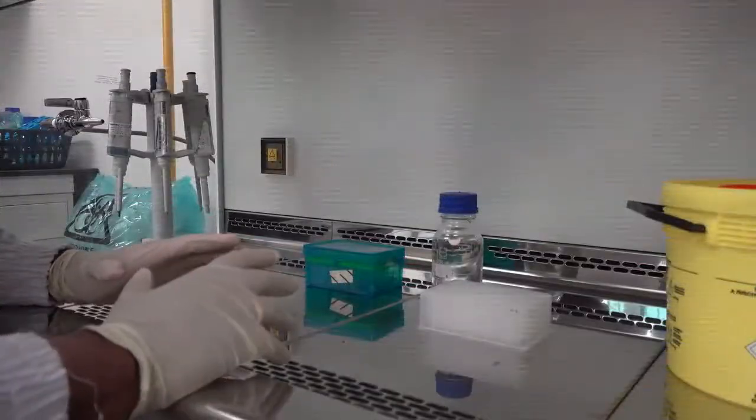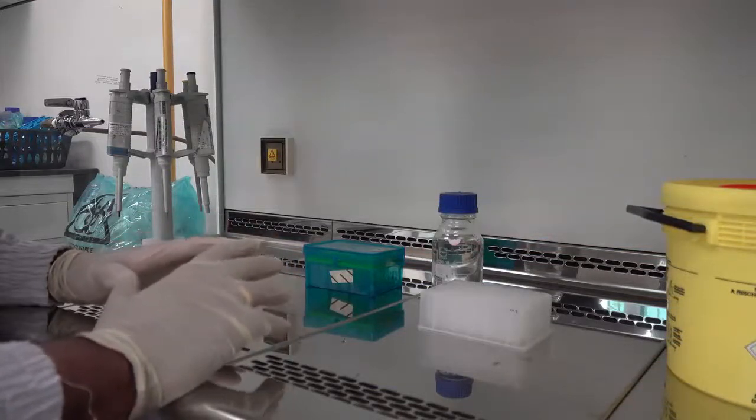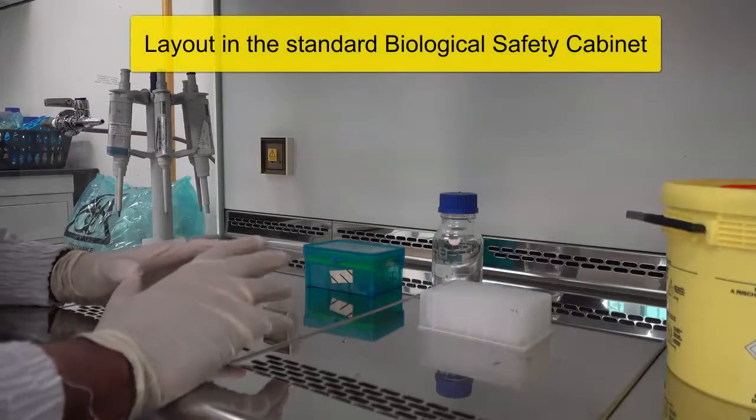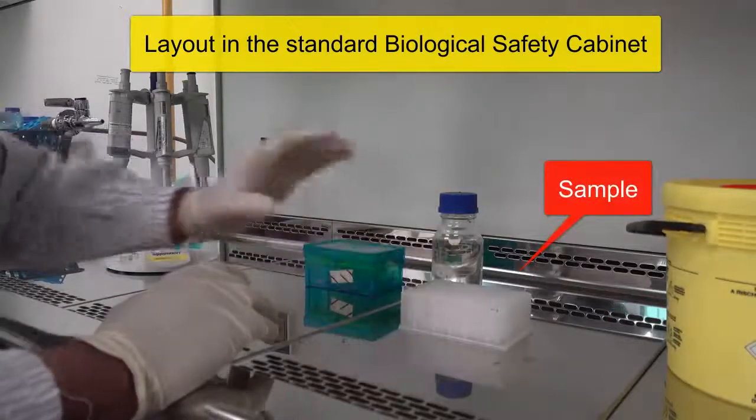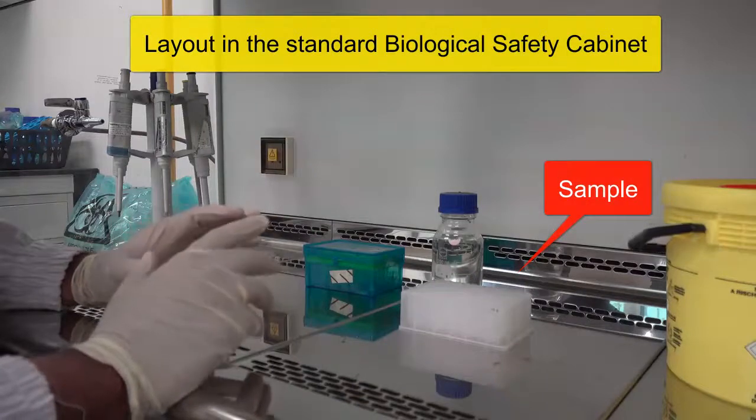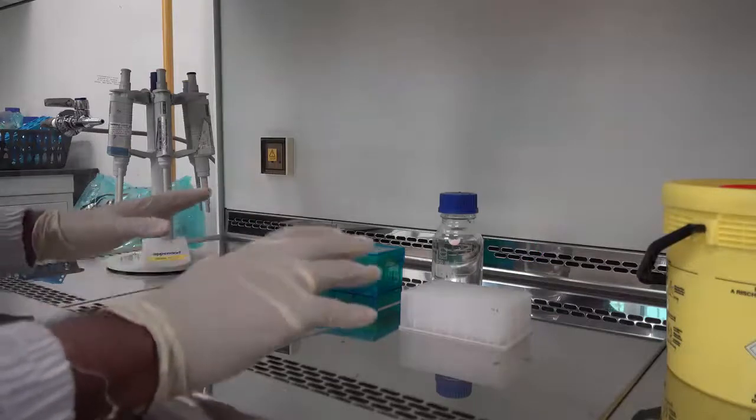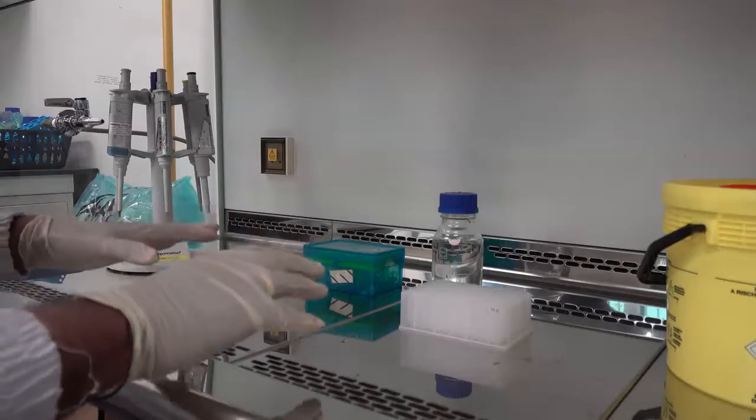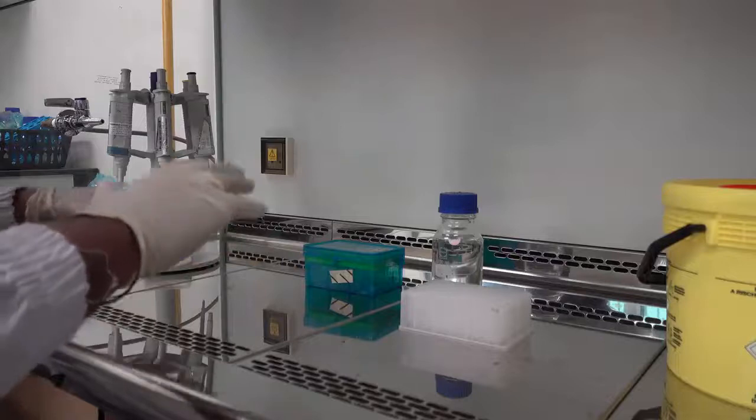In this video I will be describing to you the layout of the standard biological safety cabinet. This cabinet is designed to protect both the sample as well as the operator from exposure to the biological agent. As you can see all your equipment within this biological safety cabinet has to be laid out so as to ensure a smooth working environment.